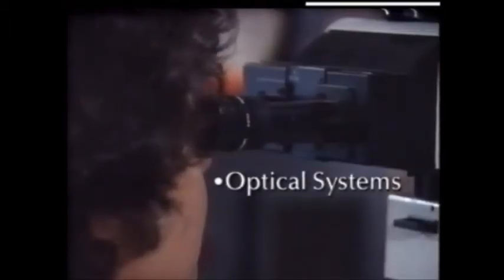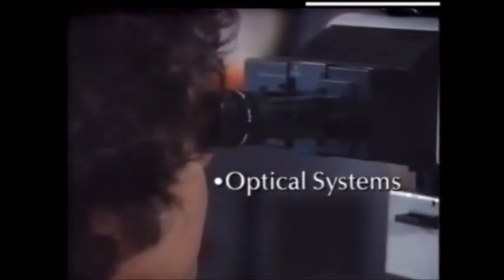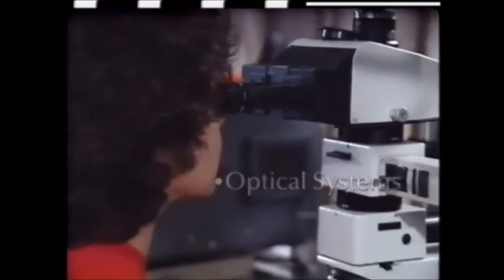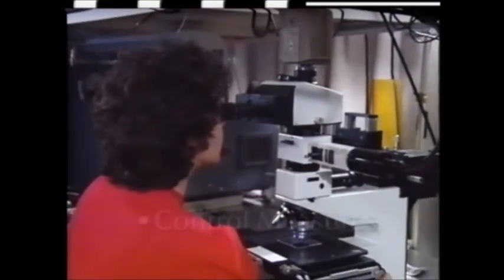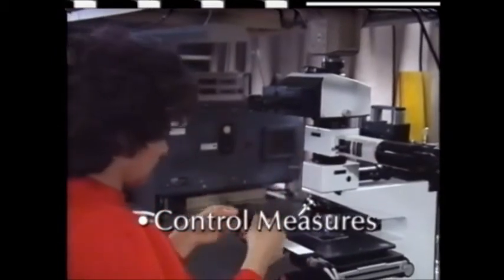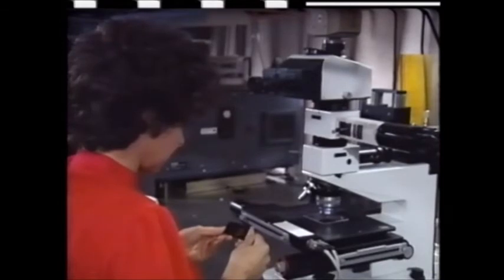Optical systems such as mirrors, microscopes, lenses, and hand magnifiers can cause specular and diffuse reflections. They can also collect and concentrate the beam, increasing its potential hazard. If the microscope does not contain a permanent filter for the laser wavelength, one should be installed before use. If you can't do this, use protective eyewear.